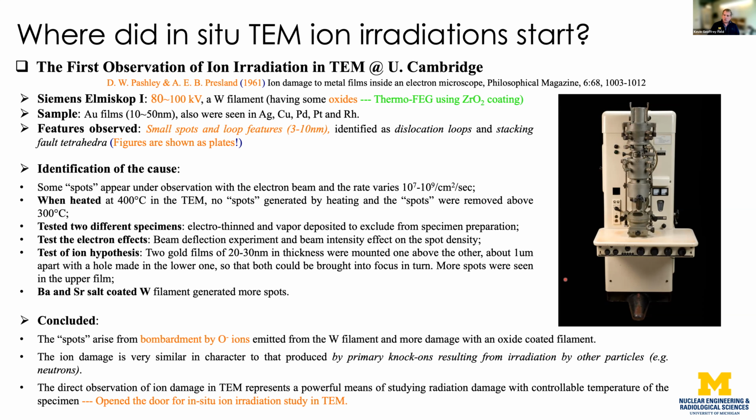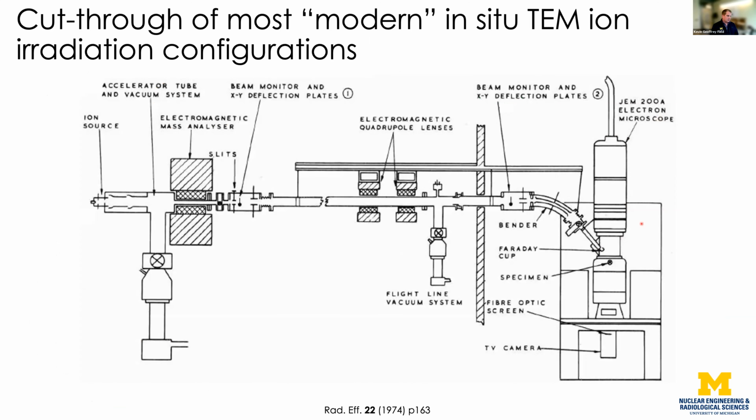And so just like penicillin was kind of discovered by accident, so too was the possibility of doing in-situ microscopy by using the electron gun as also an oxygen ion gun that coaxially accelerates down through the sample. And of course, this is a previous slide show, and as I will allude to, that's not the way we do our in-situ TEM experiments nowadays.